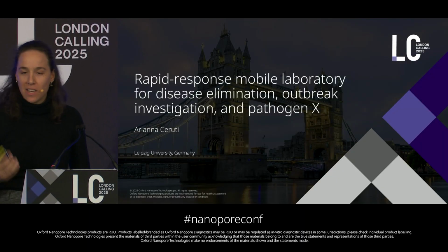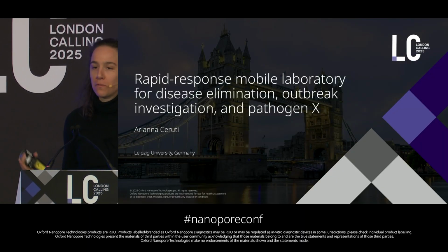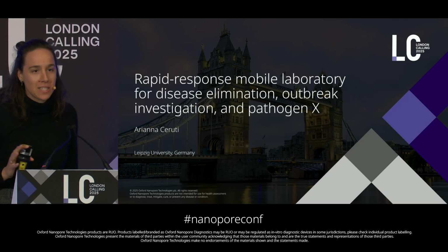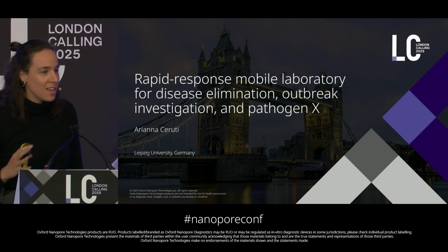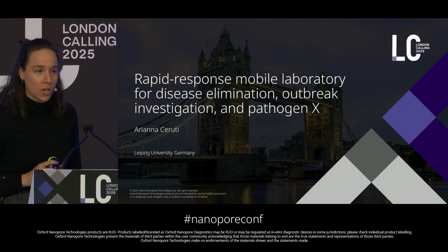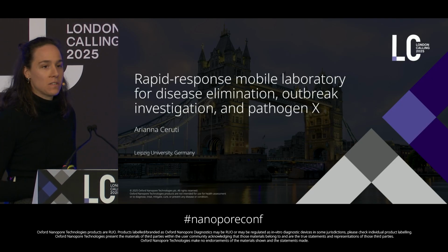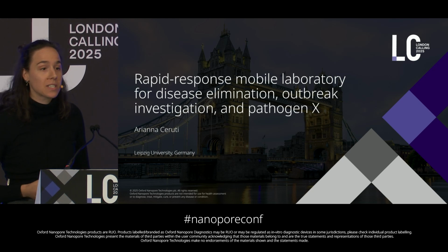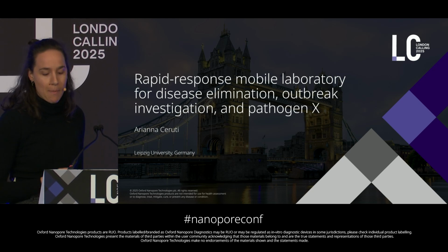So we've heard wonderful talks about innovative ways to address UTIs and dengue analysis. And now I want to take you a little bit into a different realm, which is the one of a rapid responder, so to speak, and how we can use Oxford Nanopore Technologies in the field for outbreak investigation, surveillance, and pathogen X preparedness within a mobile Suitcase lab setup.